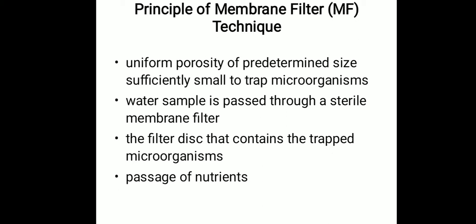The membrane filtration and colony count techniques assume that each bacterium, clump of bacteria, or particle with bacteria attached will give rise to a single visible colony. Each of these clumps or particles is therefore a colony forming unit, or CFU, and the results are expressed as colony forming units per unit volume.